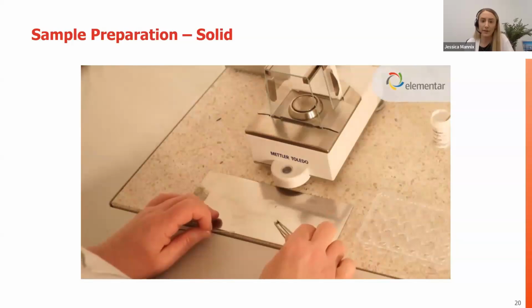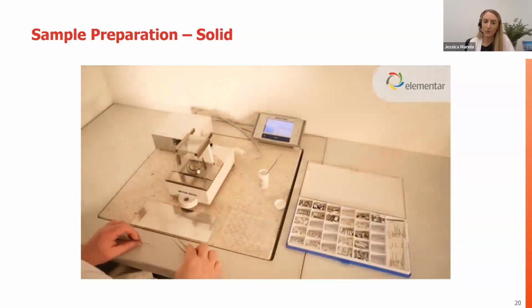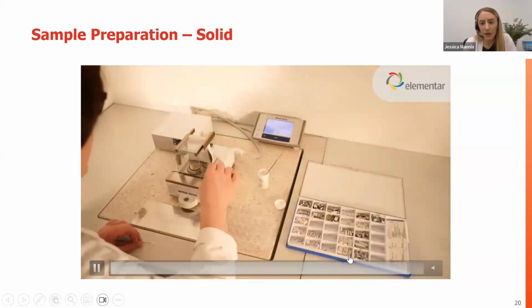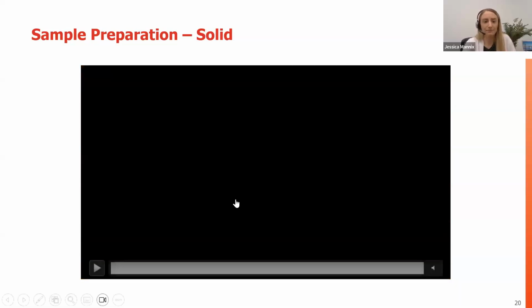What we can see here is a very, very small sample size being prepped for one of our microanalyzers. And so we see the use of forceps. In larger sample sizes, we can use even larger foils, and you can see them being added right here into larger boats or even cups if we're looking at a macro size analyzer.